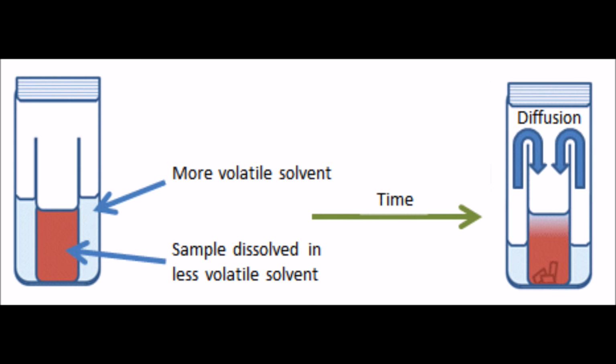Now, I'm sure you're all thinking that this whole process seems a lot more difficult than the whole evaporation process that we've been talking about thus far. And that's true, it's not even close to as simple. And also, it's very, very hard to find two suitable solvents which mix together well. However, it works very, very well in small amounts, usually gives pretty good crystals, and if you can find two suitable solvents, the parameters are incredibly easy to control.